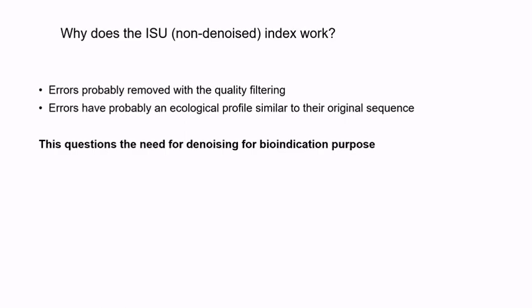So the hypothesis is that there are probably sequencing errors, but maybe their profiles look like the mother sequence, let's say the real sequence. And this is probably why it's working. And this questions the need for denoising for biomonitoring purposes.